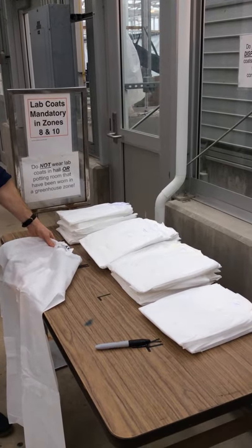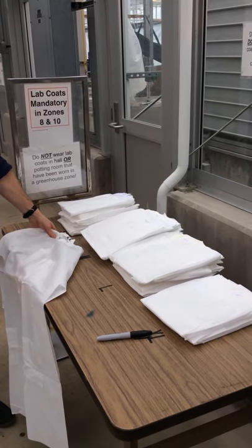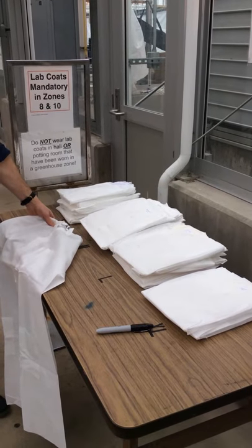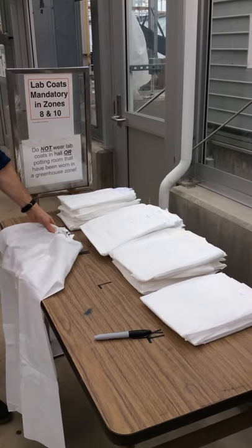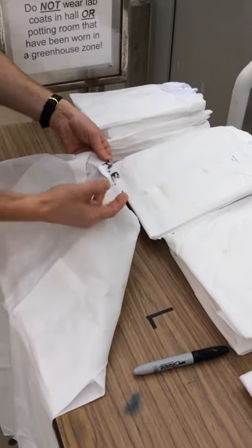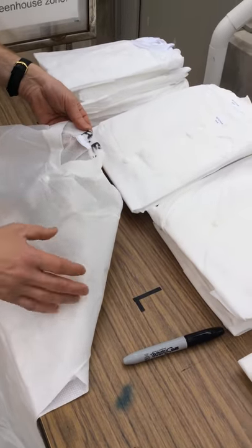A few of the greenhouses require dedicated lab coats to help prevent insects or disease from being transferred out of that zone into the hallway or other rooms. So choose from one of the four sizes. You can use a sharpie to write your name on the cuff or the collar.